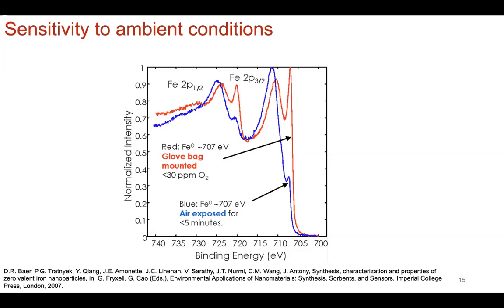Well, they are physical, they indicate that you have oxidized your sample, but they're not very useful for trying to understand the species that have evolved as a function of, say, cycling. And so that's something to take into consideration when you're sample prepping.